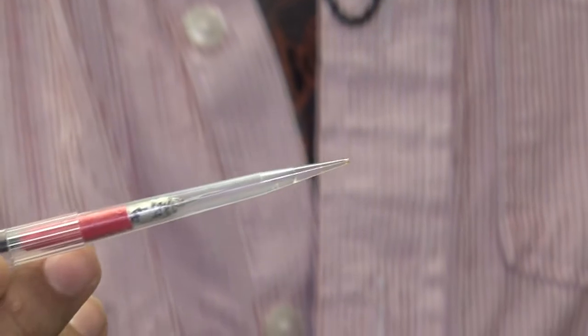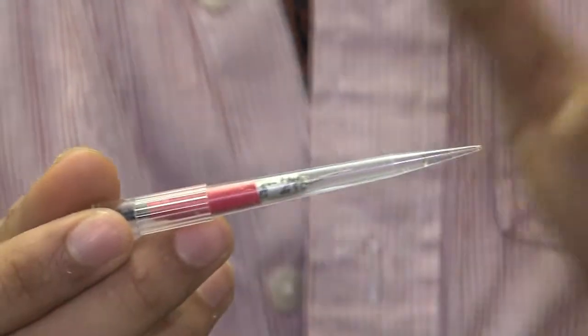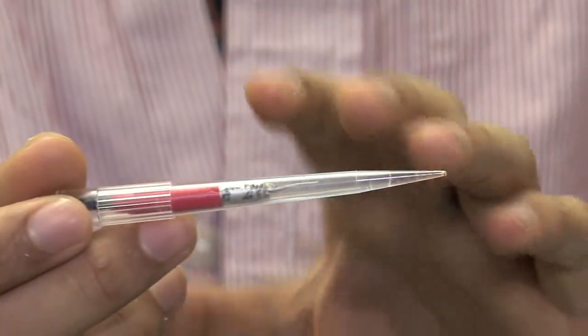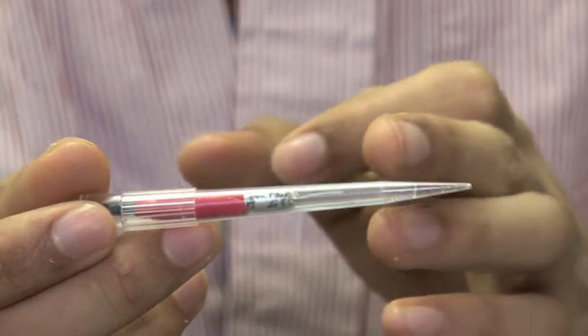This is a novel ion-selective electrode that I designed. It is built to function specifically in sediment. At the end is an ionophore membrane; behind that is a platinum wire. This platinum wire is sitting in a reference solution, and the potential at the platinum wire is measured against a reference electrode.